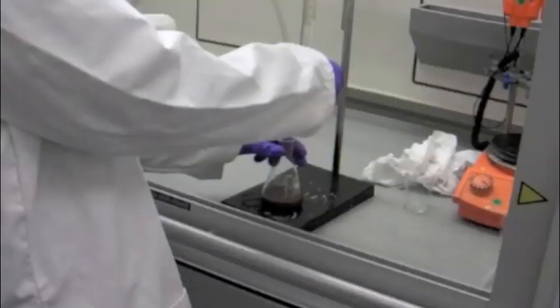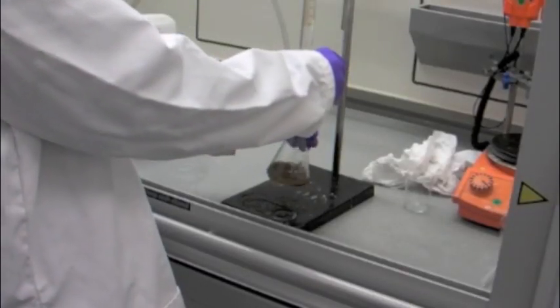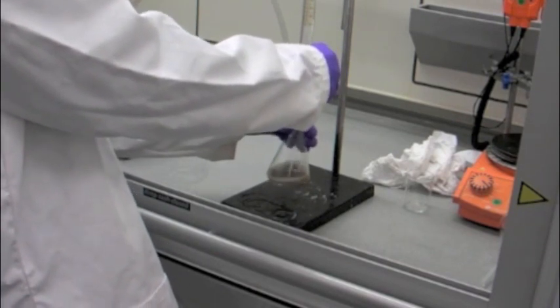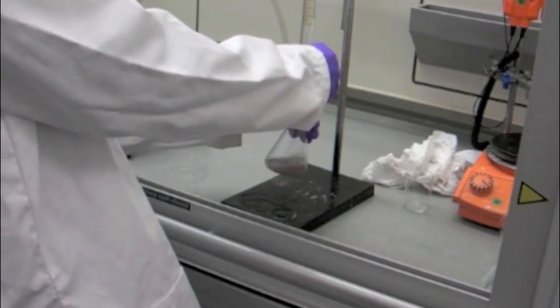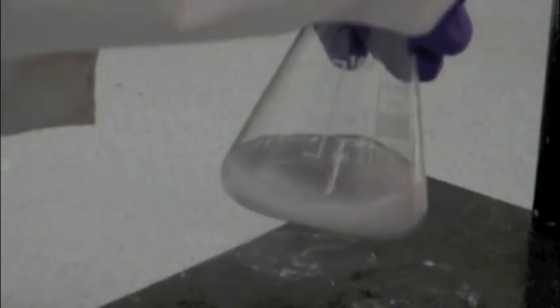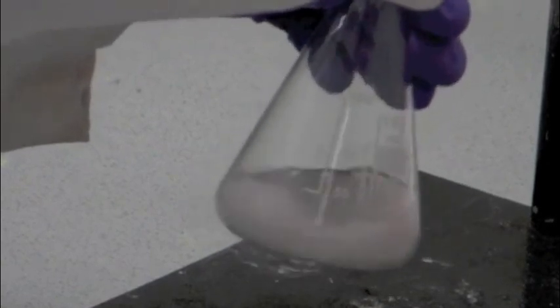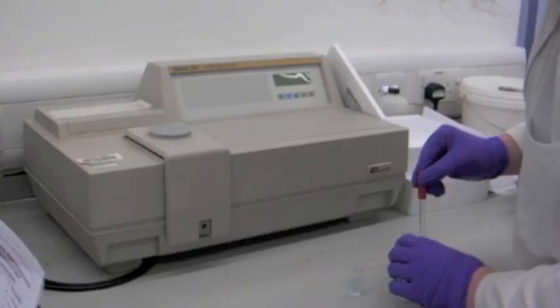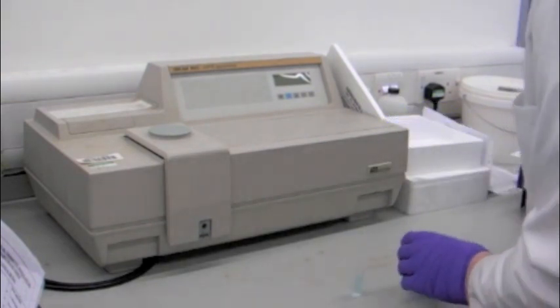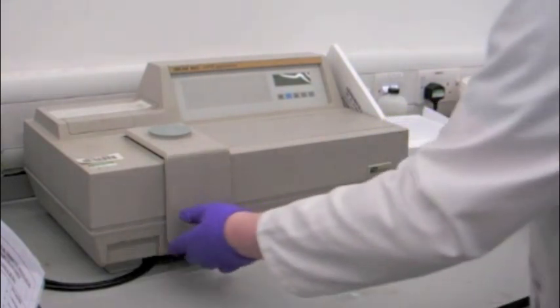The value of N was then determined — first by volumetric analysis, and then by UV spectroscopy. From this it was determined that N equals 2.